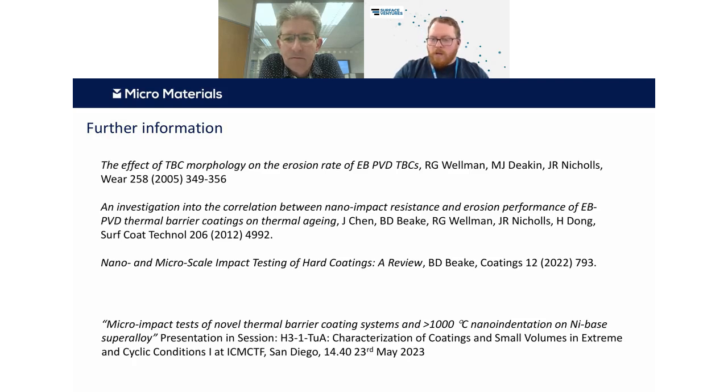Very interesting. We've got a question and a comment here from Gyuji from University of Leeds. I hope I've pronounced the name correctly. Who has asked, may I ask what's the parameter that the random impact can give to evaluate the impact resistance? Well, I think, and sorry, Ben, can I just read out the quick comment there just to make sure. So sorry, I might not get the idea you are talking about. Like for adhesion, people use critical load for the evaluation of adhesive strength.